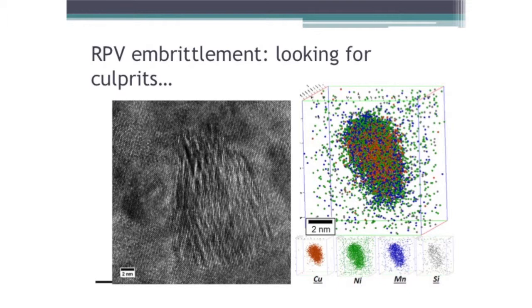These are all atoms, right? And we know exactly which they are. So they are rich in copper, nickel, and manganese. But these elements shouldn't be there in the component used in the nuclear reactor. So what we found out is that in the 50s and 60s, when the big steel plates were connected or welded to make that 15-meter component, they were using copper electrodes for the weld.